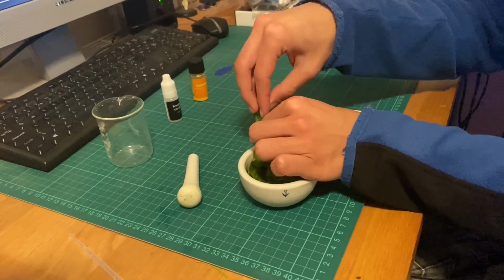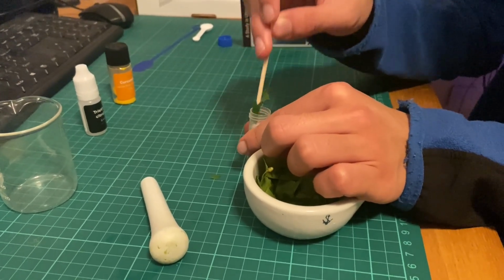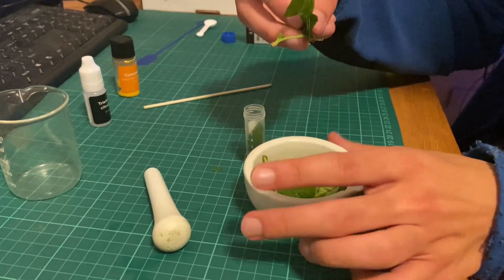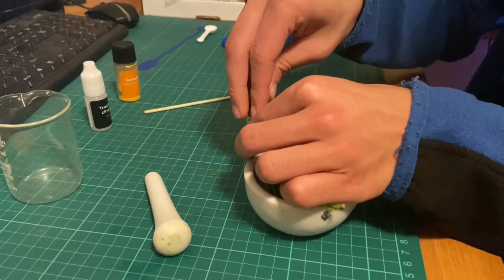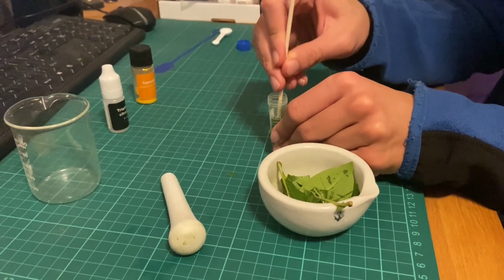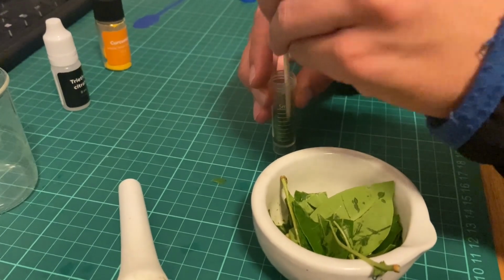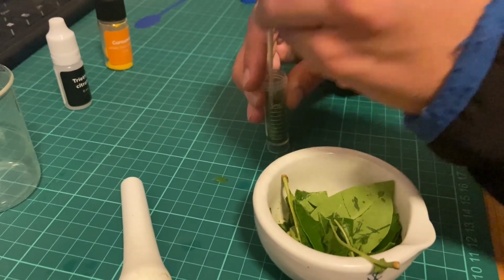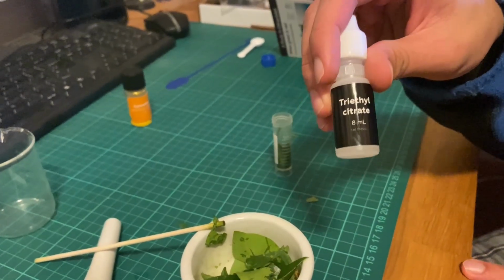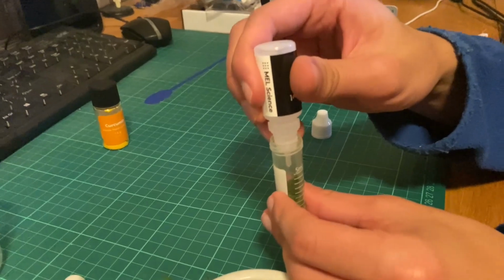We then add the result of this crushing into a vial, and then we add triethyl citrate in order to separate the chlorophyll out.